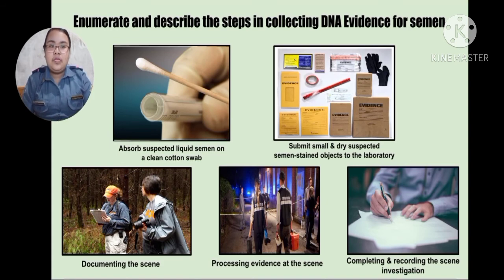Next, submit small and dry suspected semen stain objects to the laboratory. Second, kailangan din daw po natin isubmit yung mga small and dry suspected semen stain doon sa laboratory. Kailangan din natin sila ipack doon sa clean envelope with sealed corners, para ma-prevent or maiwasan natin yung stain removal.